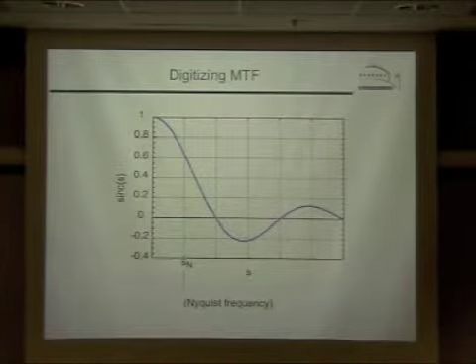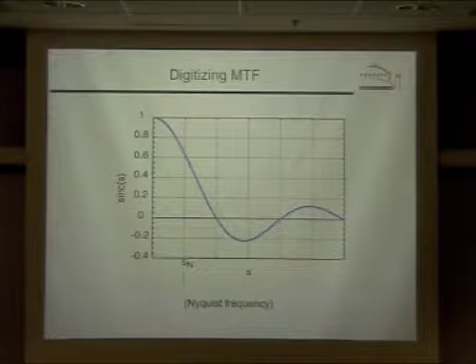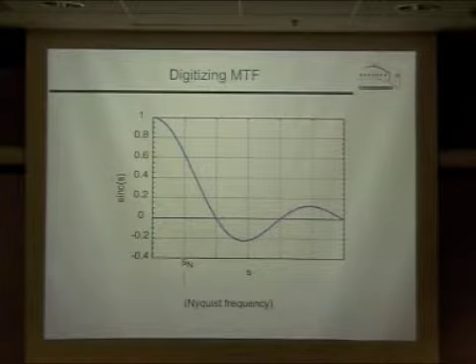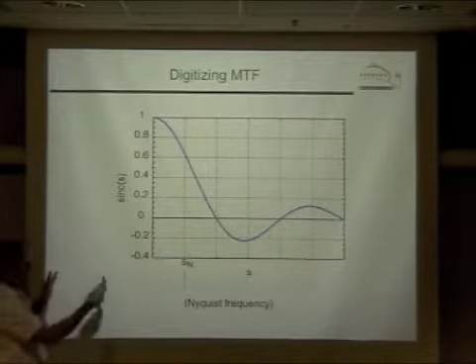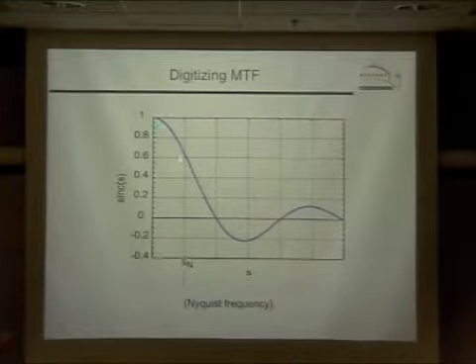Just as it can also happen if your image is a gold lattice, then you may have spots outside the Nyquist frequency, and they are folded back into it. So this graph here is tightly compressed compared to other MTF graphs you've seen, which show the MTF of the system in this range here, up to the Nyquist frequency.